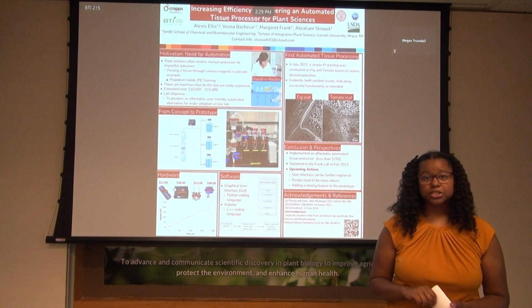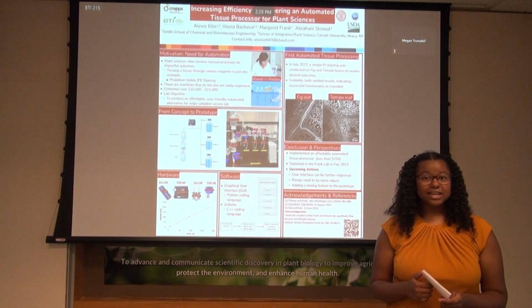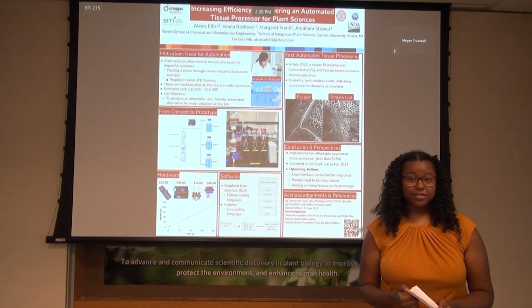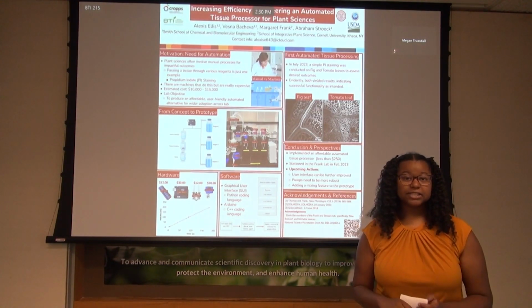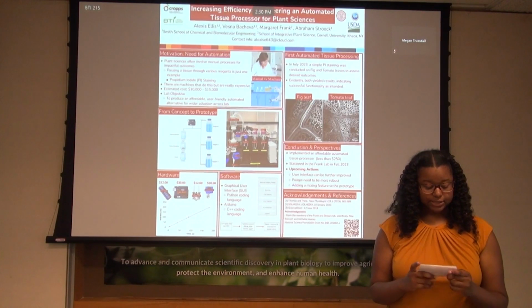This process is usually done manually, and it's very time-consuming. Now, the Frank Lab utilizes this method quite frequently. One member of the lab even expressed to me that last summer they did over 150 PI stains. To address this issue, my project combines engineering principles as well as biological processes.